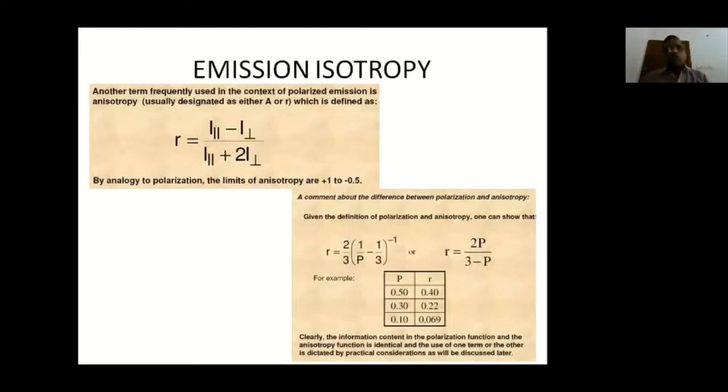So to summarize what we have discussed so far, it covers the basics of the absorption and fluorescence parameters, like the emission spectrum, excitation spectrum, quantum yield, rate constants, and we also looked at lifetimes and anisotropy, right? This is what one has to understand to start with, before you go into the fundamental details of fluorescence.